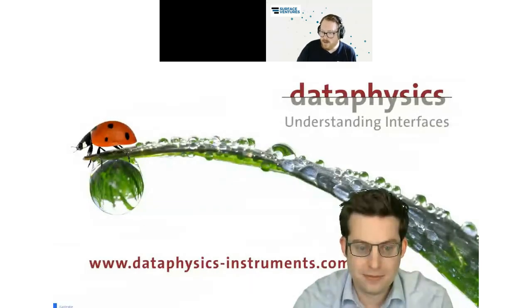Let me just scroll back to the last question that we had. We had a couple of questions asking how fibers are measured with the tensiometer?